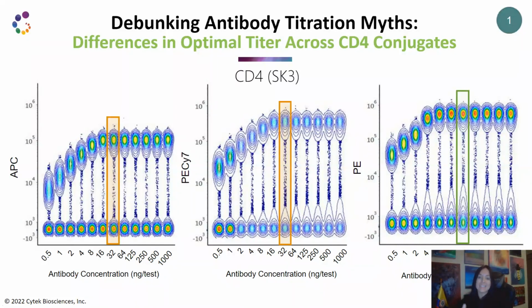This depends on antigens and antibodies. What the fluor is changing is how intense we are getting the intensity of fluorescence for the positives, and also the background, also related to the instrument. But in general, for all of them, since it's the same antibody, we are getting similar titers, similar needs in terms of antibody concentration to label at saturation certain marker like CD4.